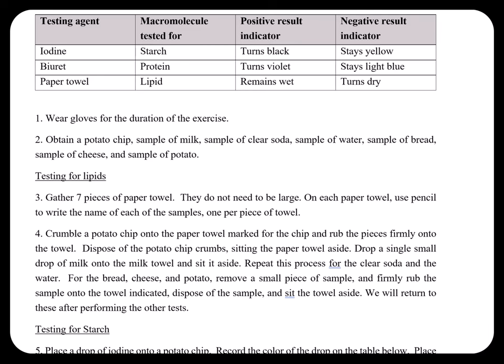I left the chemical reaction on the end of that little video clip about how to do the Biuret and what it looks like. What you need to remember is if protein is present, it turns purple. So positive protein is purple. Keep those P's rolling out there. Otherwise, it just stays blue. So the Biuret reagent is actually a blue color.